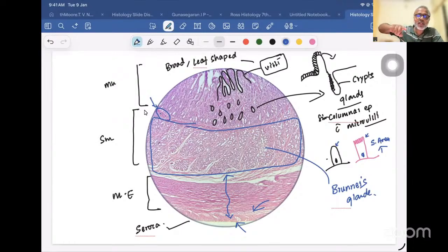In the rest of the duodenum, it is present only on the front and the sides, whereas the posterior surface of the duodenum is covered by adventitia. There is no serosa. Why? Because the duodenum is a secondarily retroperitoneal organ. It is covered by the peritoneum only on the front and the side, so there is no peritoneum posteriorly. Done? Right. This is regarding the slide of duodenum.